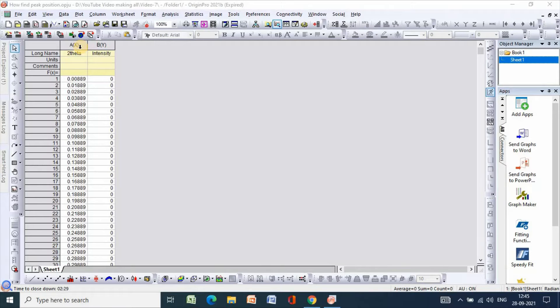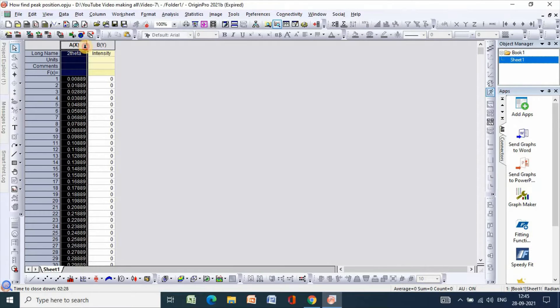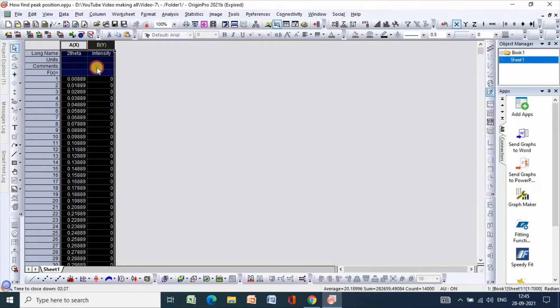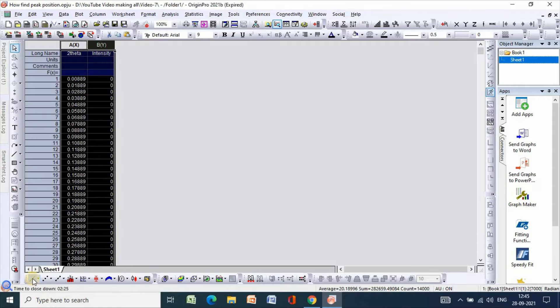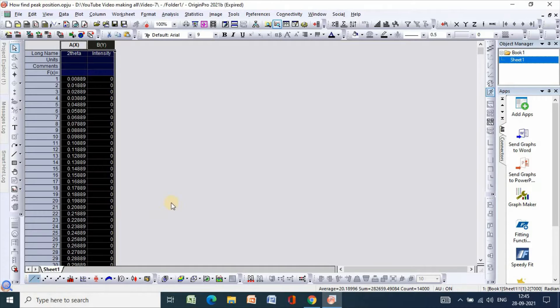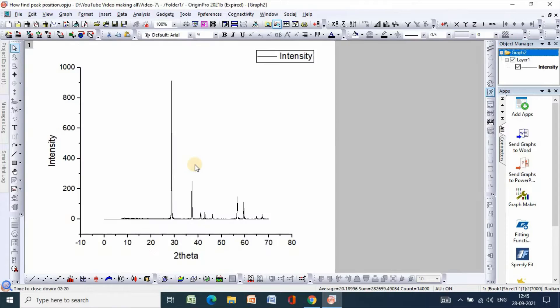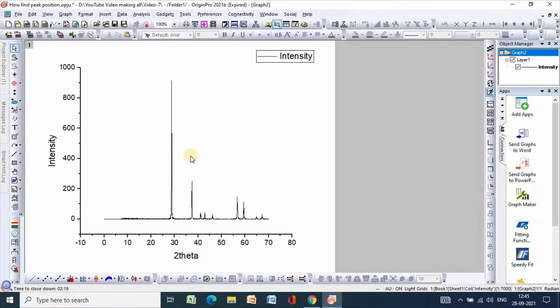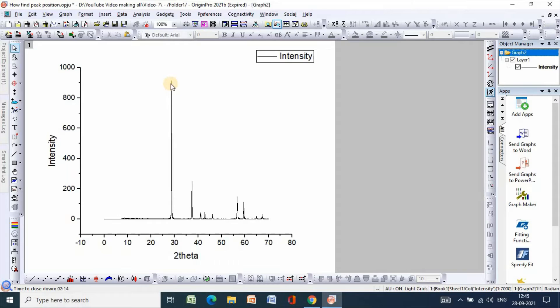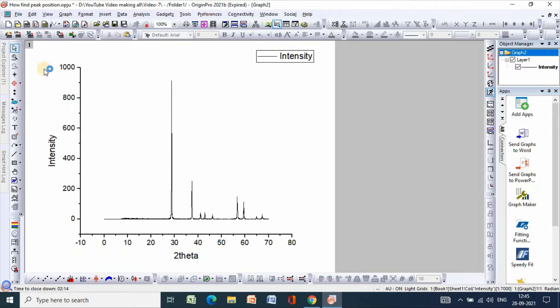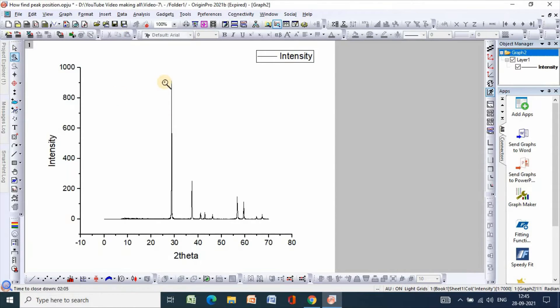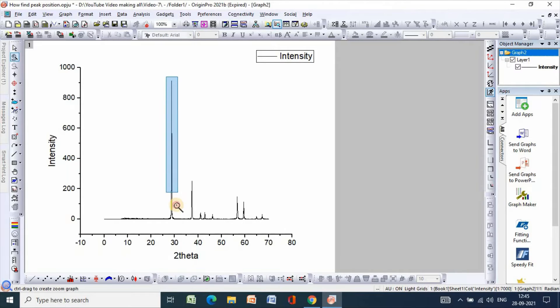XRD data, then select and click line. So here is your XRD plot. Now I will find FWHM. In order to do that, click plus, then magnify it.